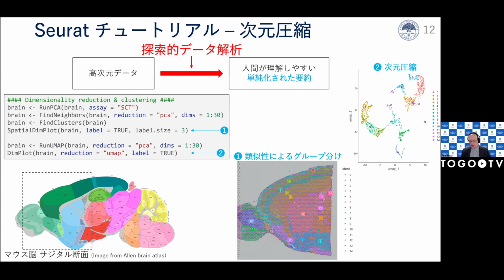And so the different colors here show the different clusters. And I think you can see there's a very clear pattern here. So this is cluster 7, and cluster 4, and cluster 6, and cluster 3, and cluster 2. And here there are 2 clusters in the olfactory bulb of this brain sample.